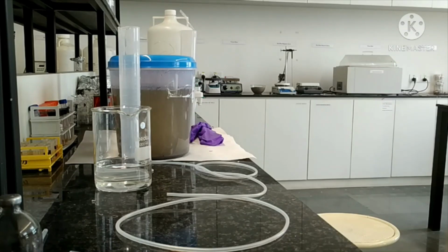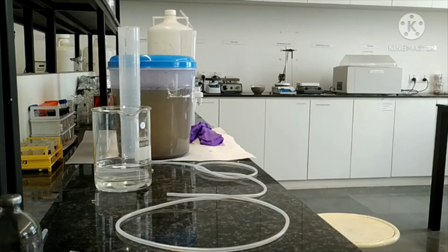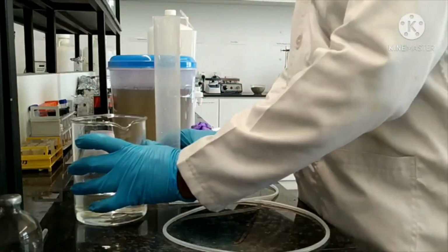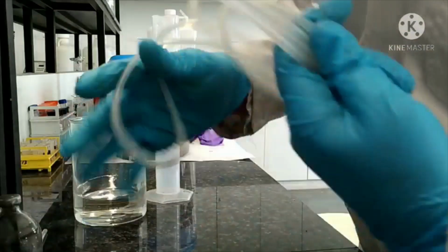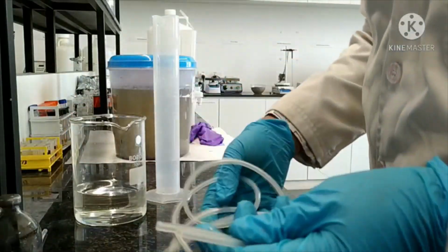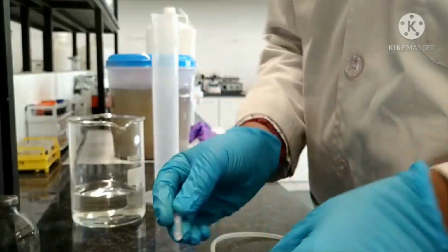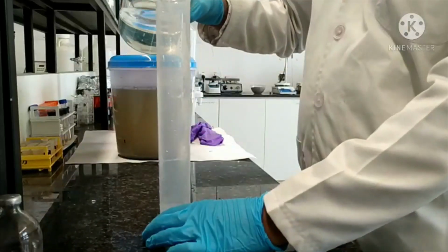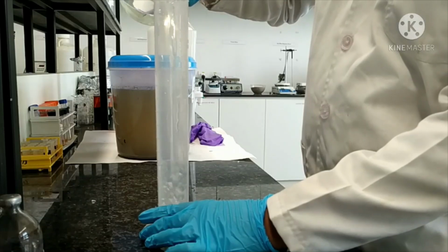Learn how to set up the gas analysis by inverted cylinder, and we will see how to use it. This is the silicone tubing we are going to use, and these are the needles to pass the gas. Firstly we will fill the water into the measuring cylinder.